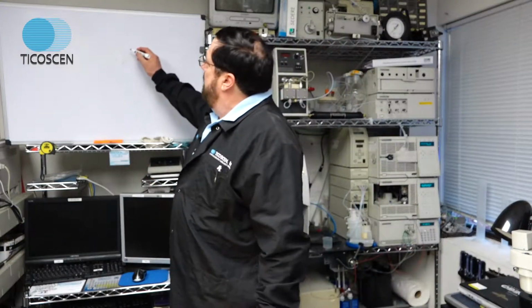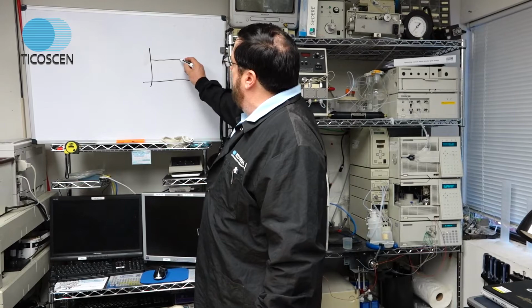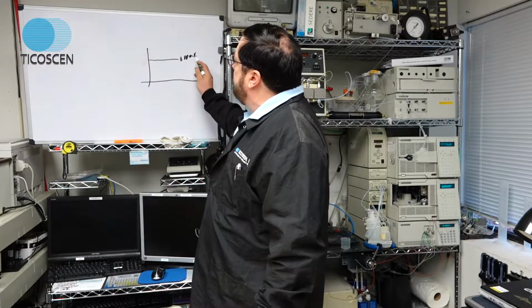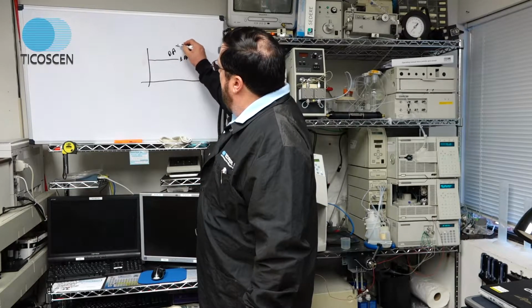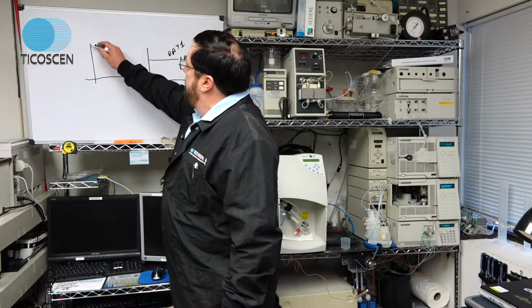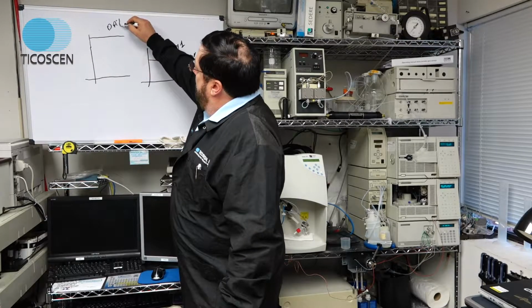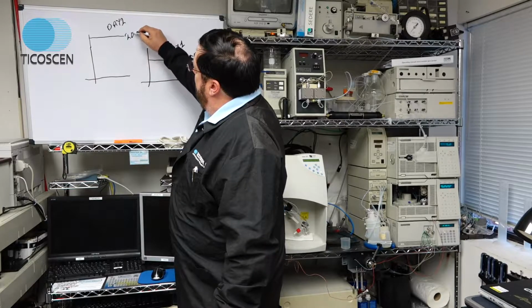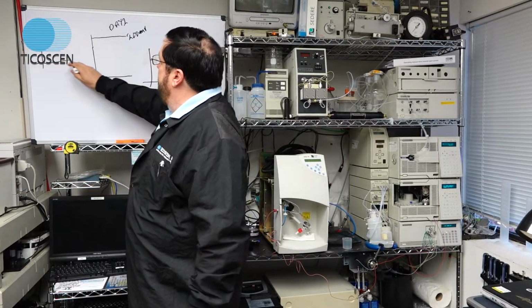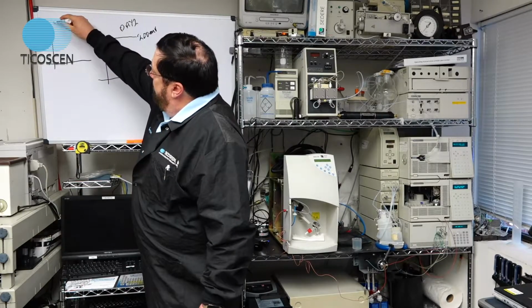So you'll start off with fresh water, and your turbidity with mobile phase only might be at like 100 millivolts with 1 ml a minute of water on day 1. On day 2, you may come in and you find that your turbidity is now up to 200 millivolts. So now you're at 200 millivolts at gain 12. And then on day 3, you might find you're up to 400 millivolts at gain 12 with your water.